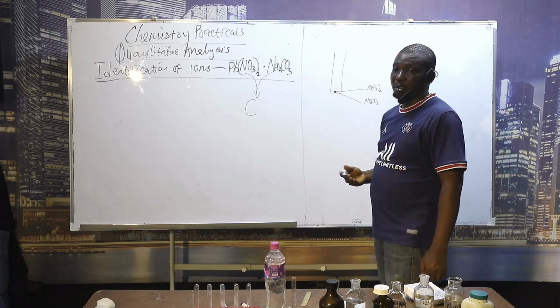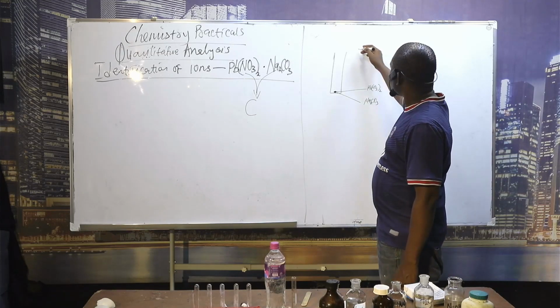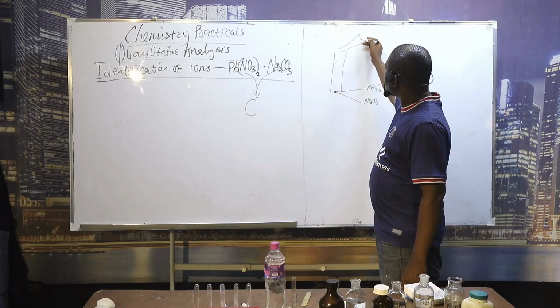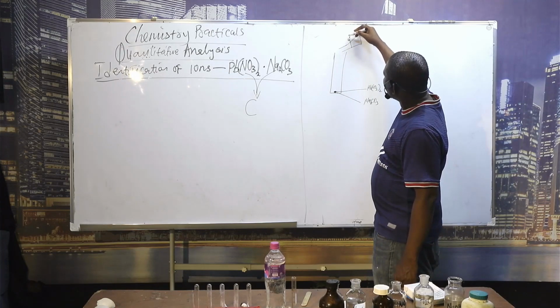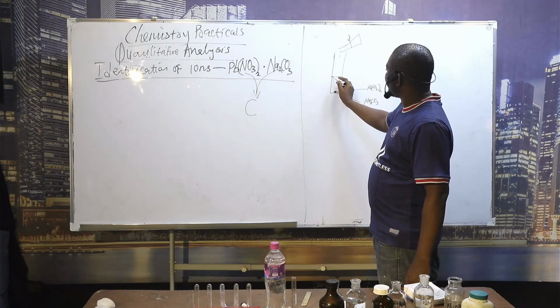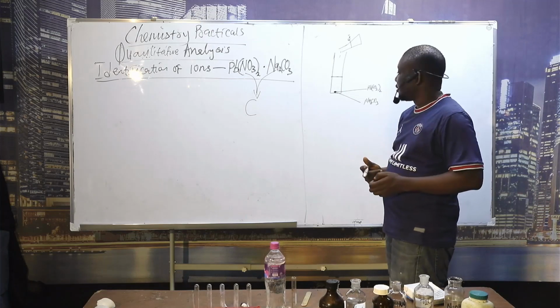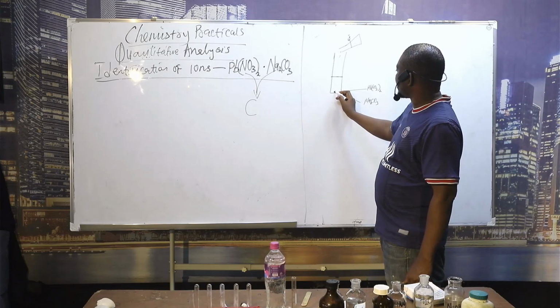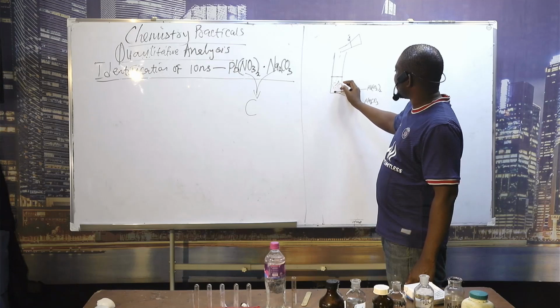The next step is to know the solubility, the extent to which this is soluble in water. So maybe I'll measure from my measuring cylinder 5 cm or 10 cm of water. I'm going to pour it in here. Let's say this is the level of 5 cm poured in. The moment I pour, I need to shake, to ensure homogeneity. As I shake, some part of this will dissolve. Let me say that these are the parts that dissolve.